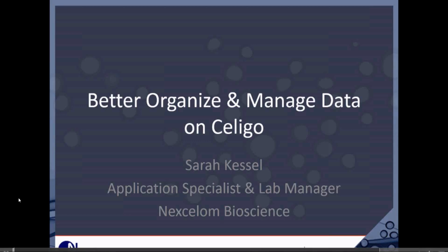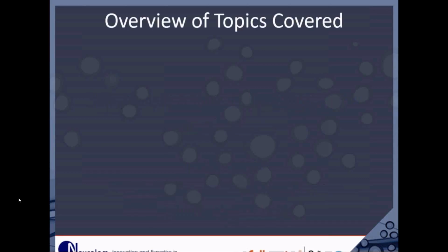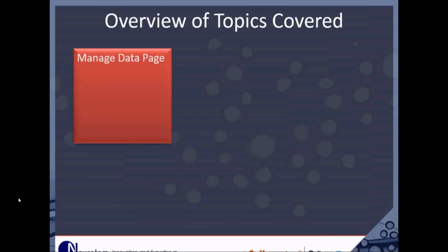Today is more about housekeeping maintenance on your Celigo. So you probably have a lot of people working on your Celigo and creating a lot of scans, and you're like, oh, I want to better organize it. So I'm going to show you some of the tricks that you can use to help you do that.